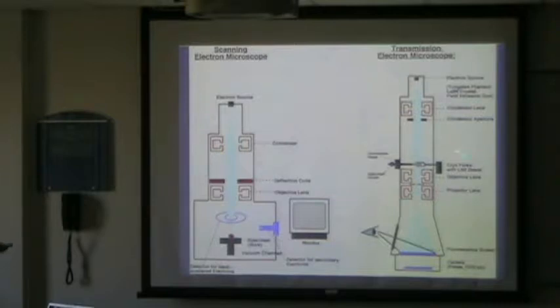This is different in the transmission microscope. So we have here our stage with the specimen. Okay, what I forgot to say, of course, is in the scanning case the specimen can be large. It can be as large as a finger, or it can be a stone, or anything like that. It does not need to be transmissible. In the case of a transmission microscope, typically 300 to 400 nanometers maximum thickness. If you get more than that, you get into problems with multiple scattering, and at some point it's just pitch dark and you don't see anything.